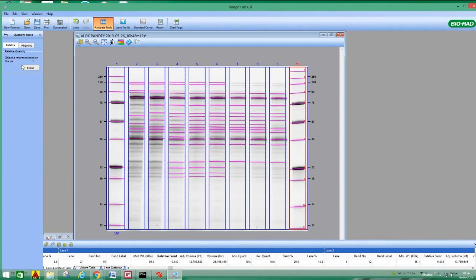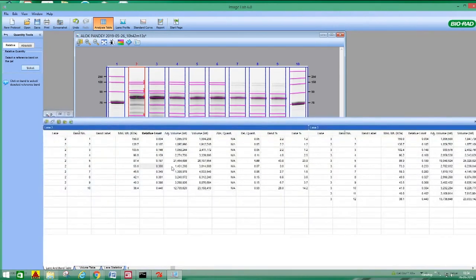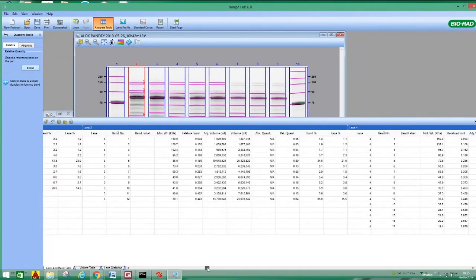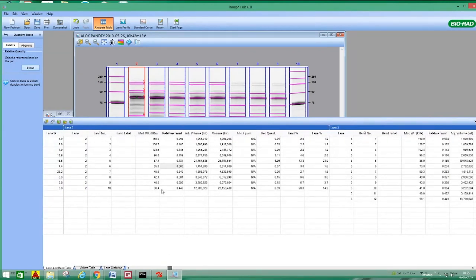There are two parts. One is relative quantity. Select a reference band on the gel. So you have to select one reference band. Based on that, it will calculate all the bands' relative quantity, but it does not give any value. Suppose I am selecting this one. This is the reference one. So automatically it will calculate the remaining proteins, lane 3. This is lane 2.